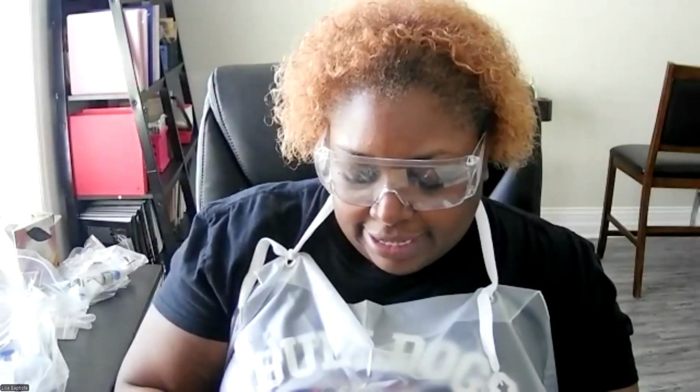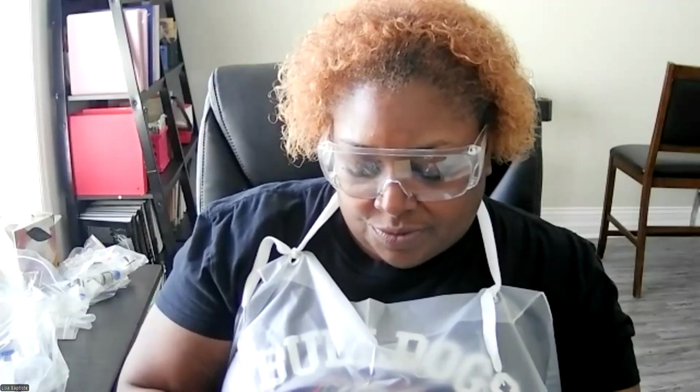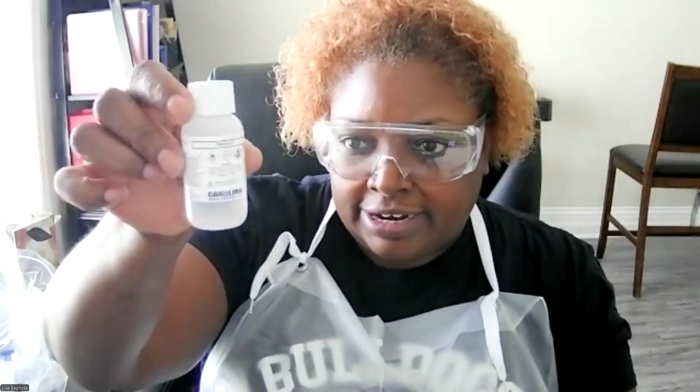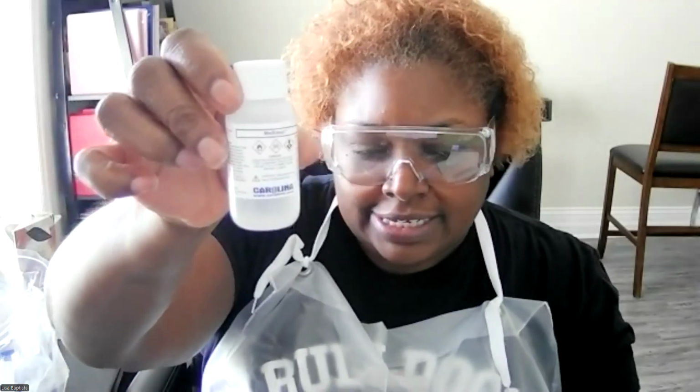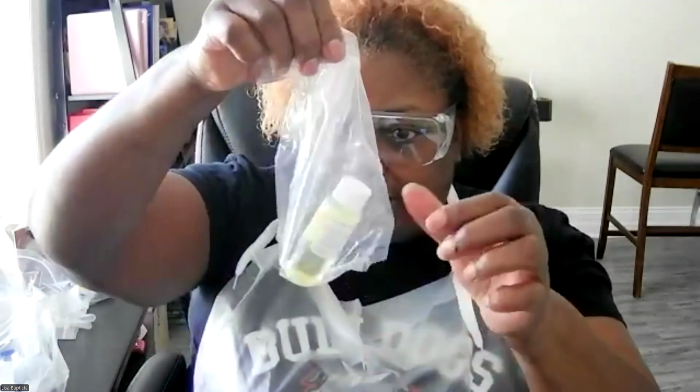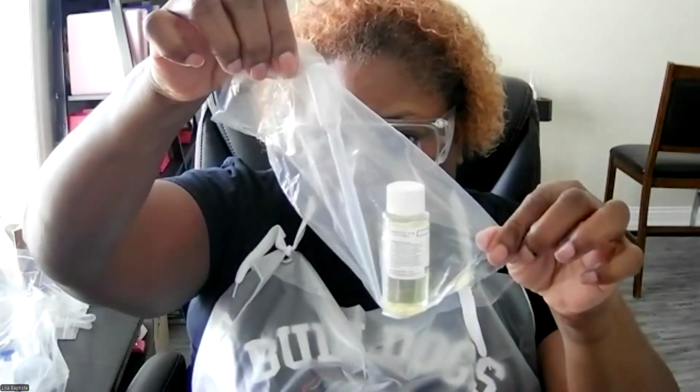So you want the glass vial, which you have here. It says that the calcium hydroxide is in a 1 gram glass vial, but it's 1 gram of it in a packet, not in a glass vial. Then you want your methanol. Your methanol is here in the clear plastic container. And you have vegetable oil. The vegetable oil comes in here, and it also comes with the dropper.